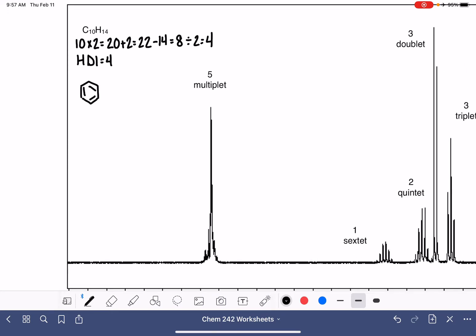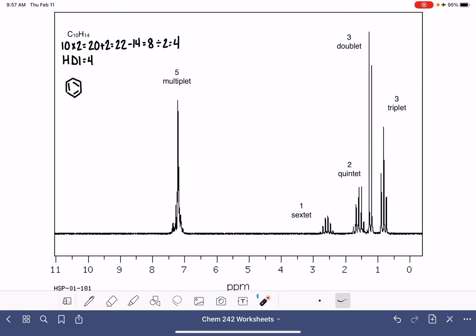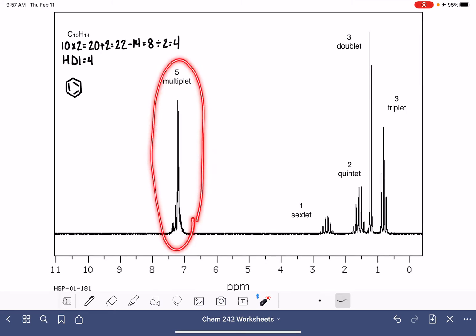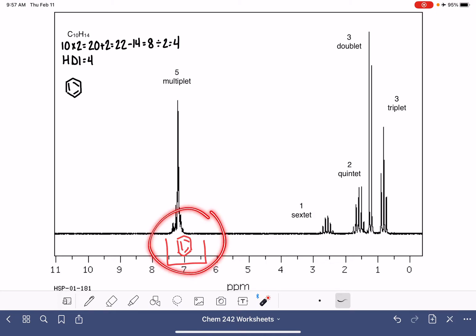When we look at the proton NMR, we can see this peak here around 7. This is definitely a peak that corresponds to a benzene ring. Benzene ring peaks typically show up somewhere between 6.5 and 7.5, and they are always really kind of noisy, jaggedy peaks with weird splitting patterns — just multiplet instead of being something like a singlet or a doublet. So this is consistent with the idea of a benzene ring.